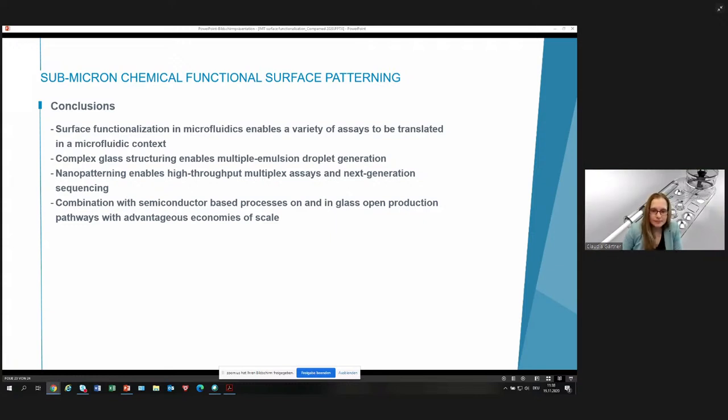I mean, for example, this is an expensive flow cell, but you also have millions of measuring points, right? So basically, at the end of the day, it is what is the price of the data point? If you're having densities of, let's say, 500-600 nanometers, you're having 500 billion, I do not know how many dots. At the end of the day, you can get a full genome sequencing down to $500 for the end customer. This is the economies of scale that this combined lithography with functionalization facilitates.